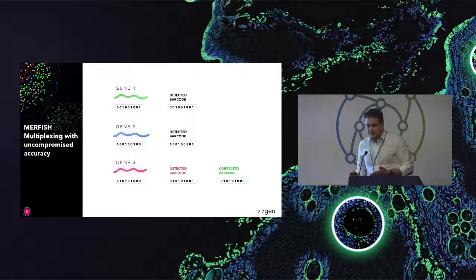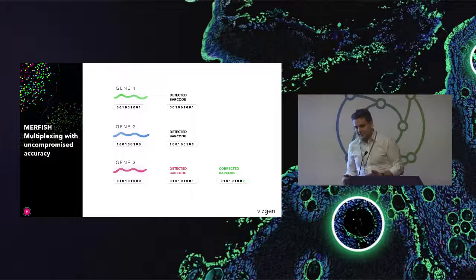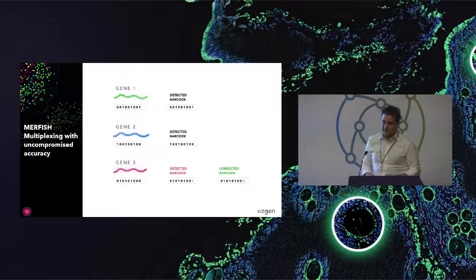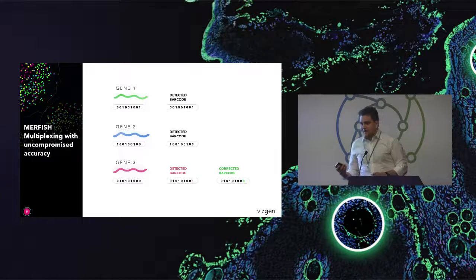But it's limited by the number of distinct molecules you're able to count simultaneously within the same tissue slice, because it's fluorescence-based. With traditional fluorescence measurements, you maybe measure 3 or 5, sometimes 7 distinct colors within an imaging round. But to really understand the biology, for example, in the brain, there's hundreds of different subtypes of inhibitory and excitatory neurons. To really characterize that, you have to measure a representative number of genes, hundreds or thousands of genes. So to build single molecule FISH up into something that's that highly multiplexed, MERFISH introduces this binary encoding scheme.